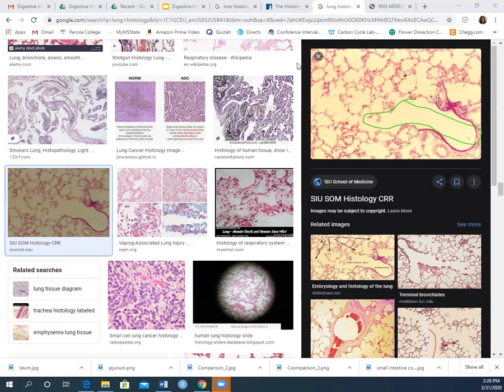And then from the bronchiole, you're seeing the alveolar ducts go down like that. Does that make sense? See how much bigger that bronchiole is than that alveolar duct? And then each collection of these areas here are your alveolar sacs, around like that.